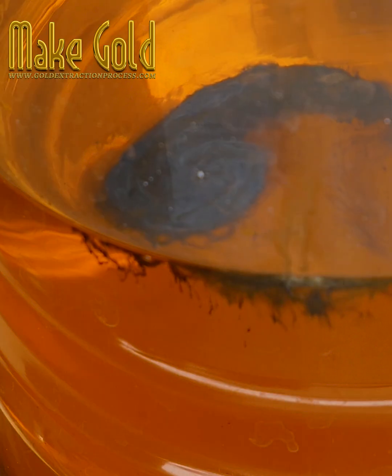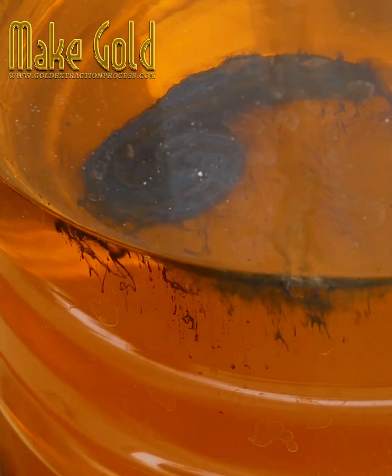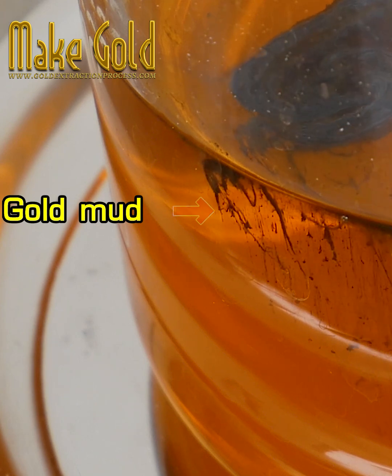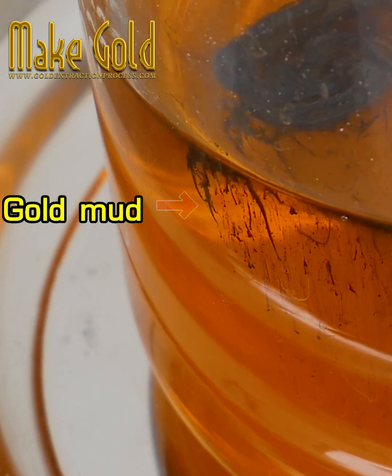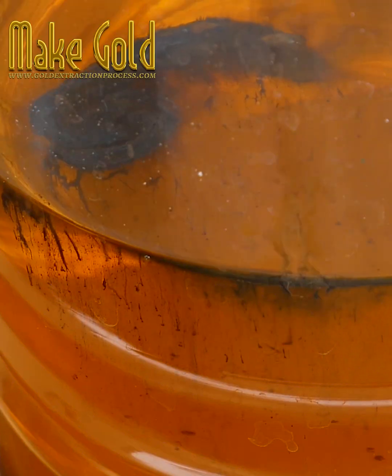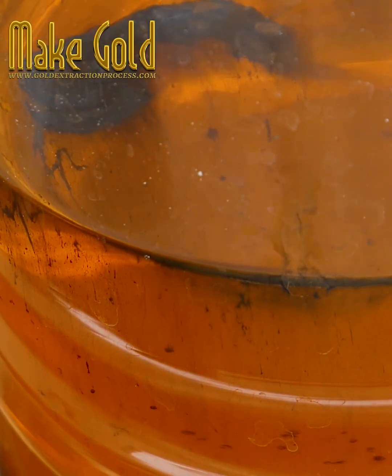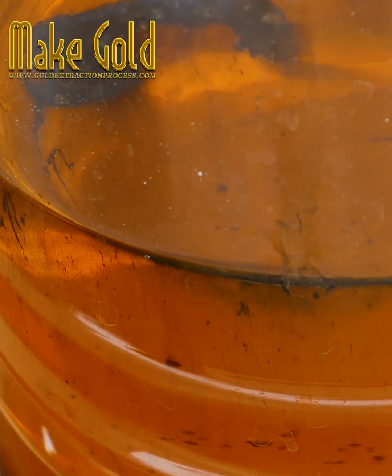Sodium metabisulfite, also known as sodium bisulfite, is an affordable and effective selective precipitant for gold. The chemical can recover up to 99.95% of pure gold when the precipitated gold is thoroughly rinsed. It works well even at room temperature.